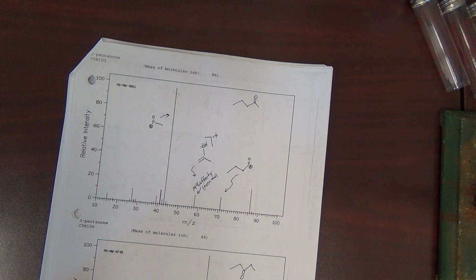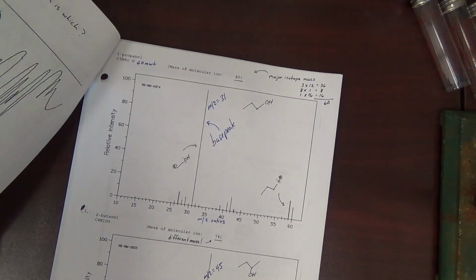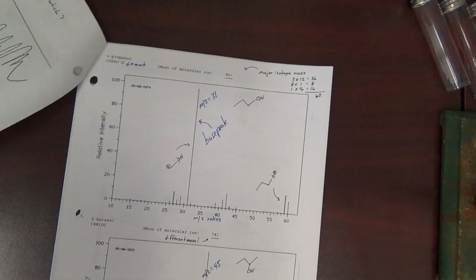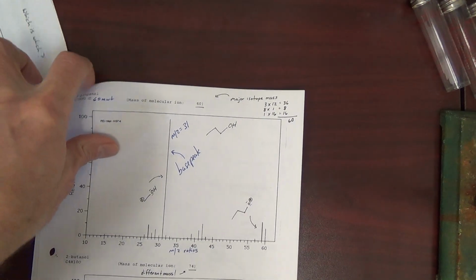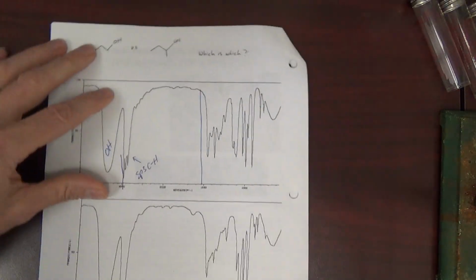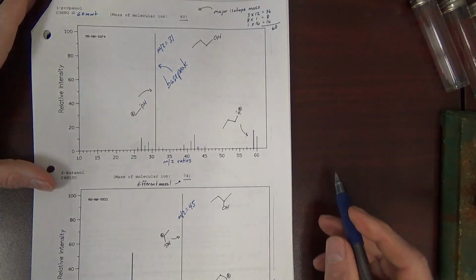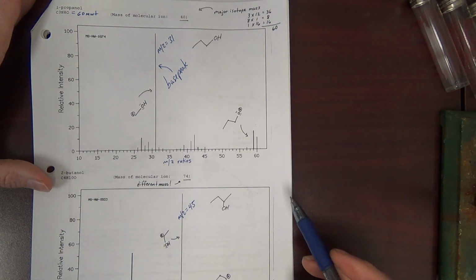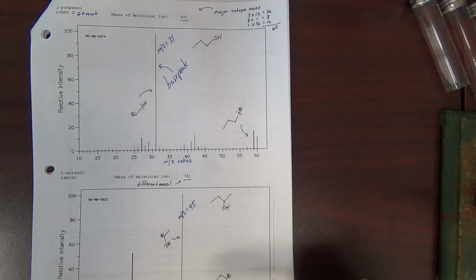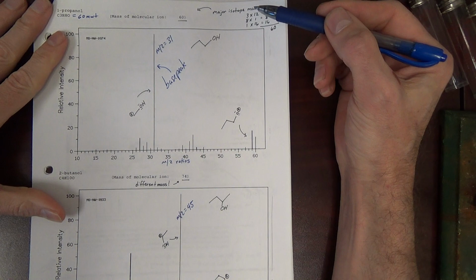Okay. Maybe with that example, we can go back to the beginning now and make a comparison with the very beginning, when we looked at the IRs of the two alcohols. Here are the mass specs. These would be the mass specs of the two compounds.